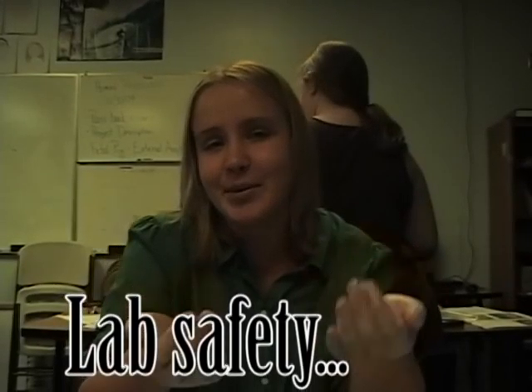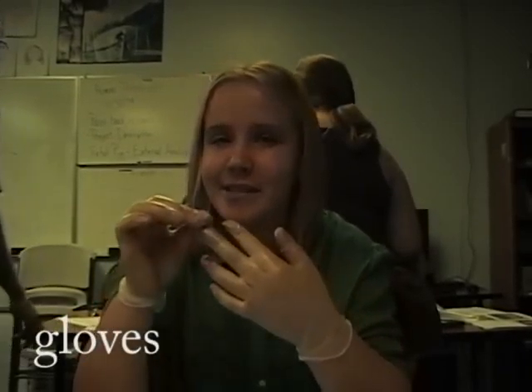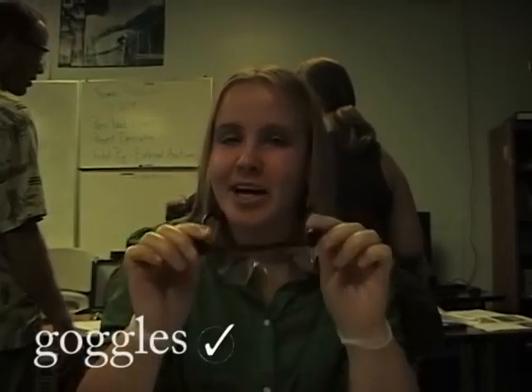Your lab. You always want to remember lab safety. You always want to wear your gloves. And you always want to wear your goggles to protect your eyes.